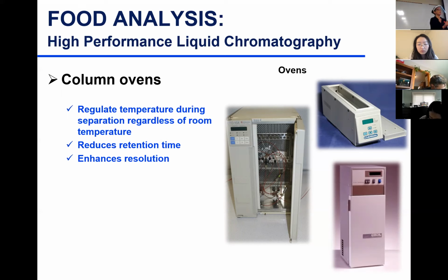And like I said, having a higher temperature really helps with shortening analysis time, getting sharper peaks, and enhancing resolution, but definitely you don't want too high of a temperature. You might damage the column. Also with very fast movement, you would end up with components eluting fast and not separating. So again, you want to find this sweet spot.